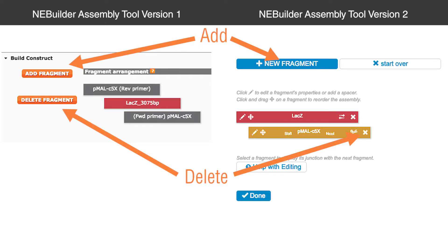In version 1, the delete button brought up a dialog to choose which fragment to delete. Also, editing a fragment's properties is initiated by clicking the pencil icon in version 2. In version 1, a double-click on the fragment opened the edit window.